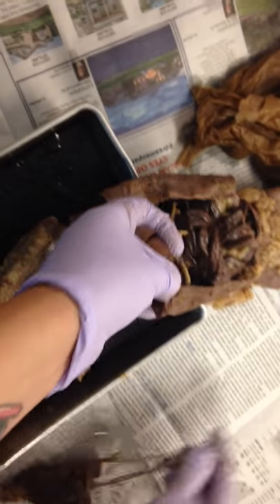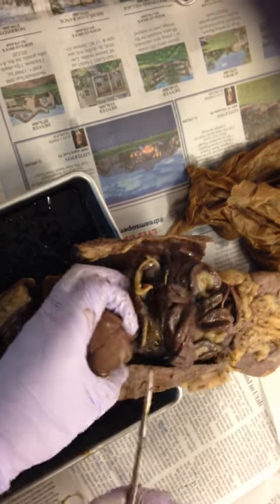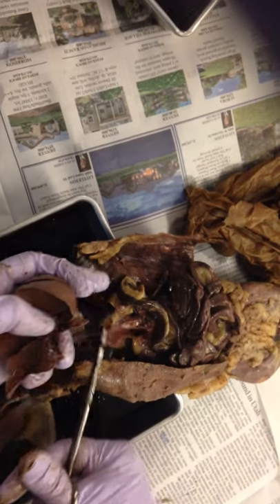So now, grab my scissors here. Now that I have this cradled, again, I'm trapping my esophagus under my other finger. I can cut through these little blood vessels and some of this mesentery. I've got maybe some more diaphragm over here. I can see that connective tissue. You see all that? Again, I see my esophagus here, so I know I'm not cutting through it. And now I've removed my whole liver.